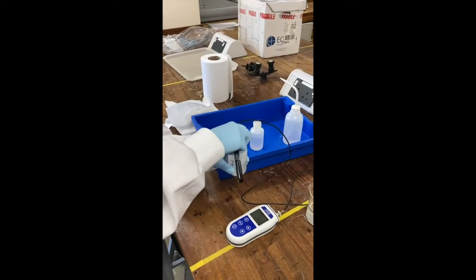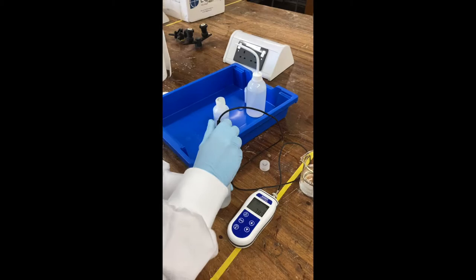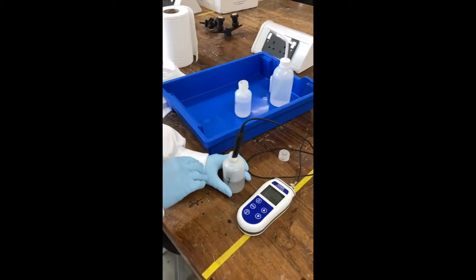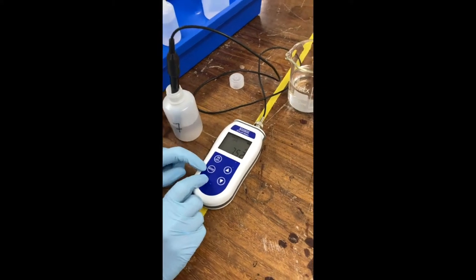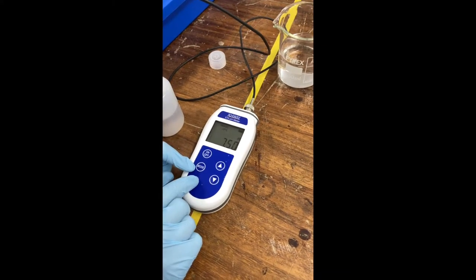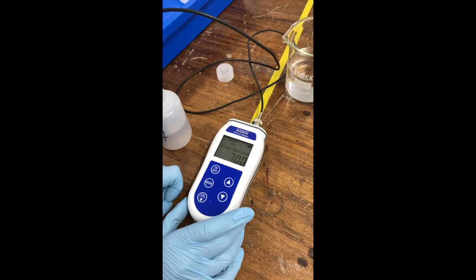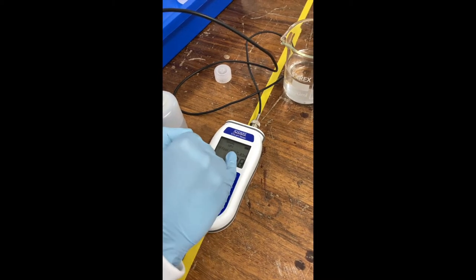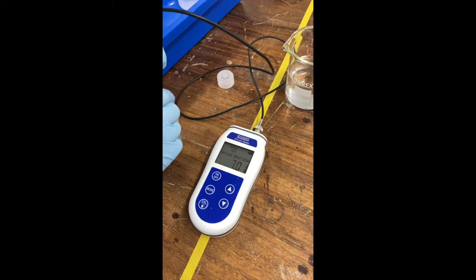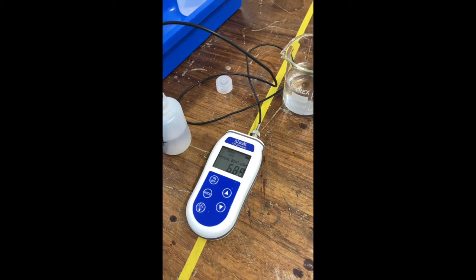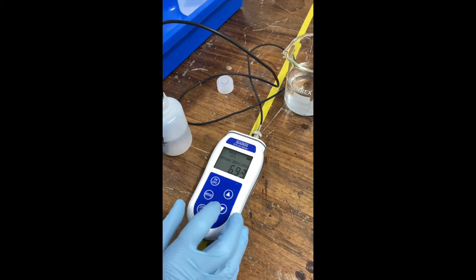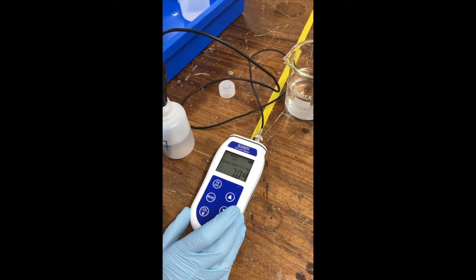And then take your first buffer, normally that would be a pH 7, and place the probe in fully submerging it. You'll then need to press calibrate, and it will guide you there that your first buffer should be pH 7. Wait for the numbers to settle down, and then press calibrate again.